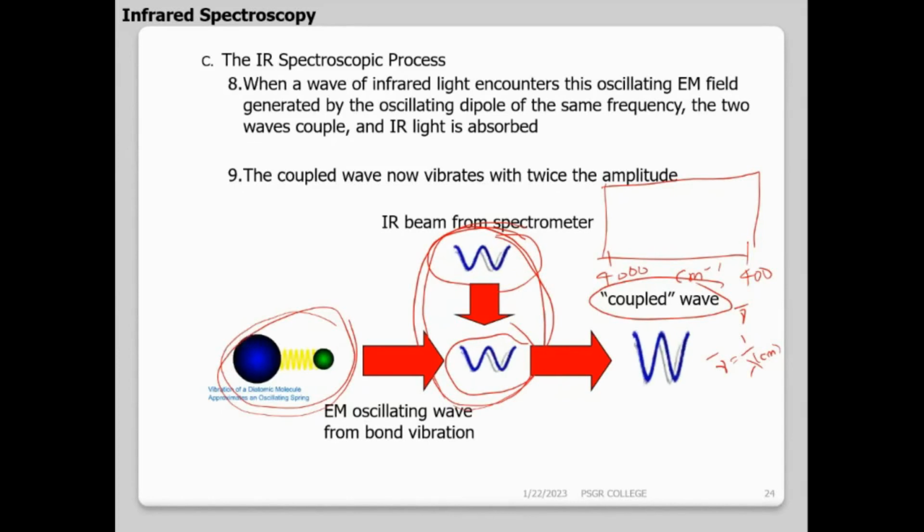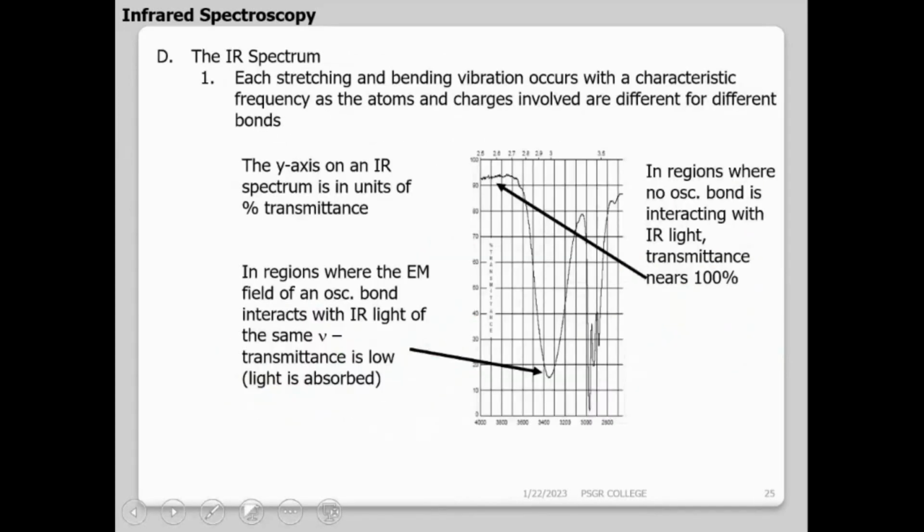So if the molecule absorbs in this particular region, the radiation created in my bond, that is electromagnetic radiation, and the radiation from my IR instrument, what happens? They match. I'm getting absorption. Okay, so this is how I'll be having the presentation of the IR spectroscopy.